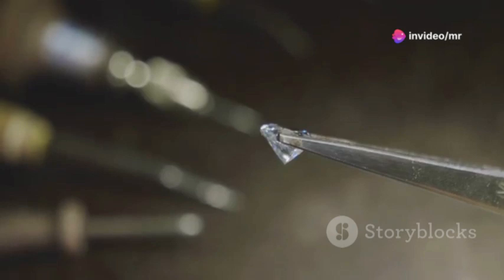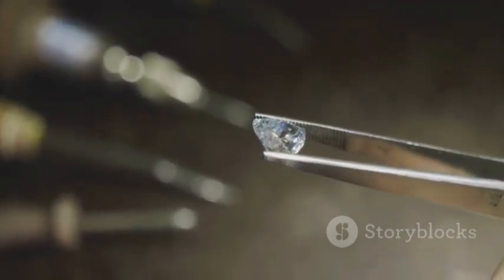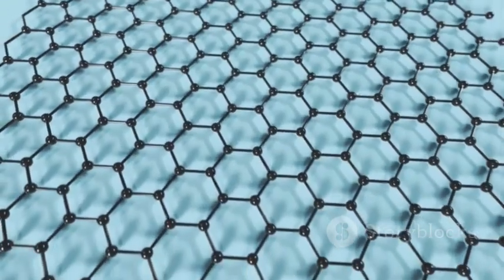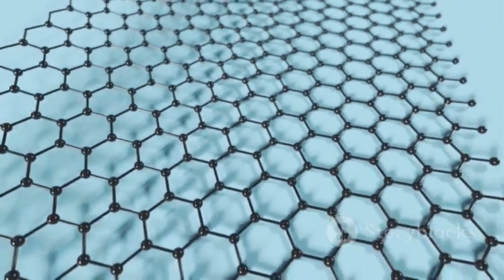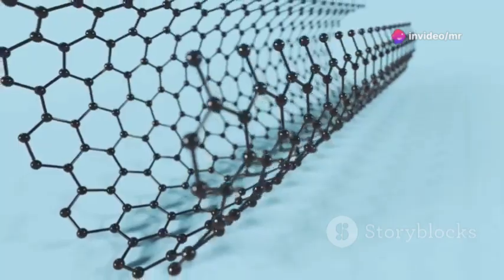X-ray diffraction, or XRD, helps us identify these fingerprints and tell different materials apart. By analyzing how X-rays scatter off a material, we can determine its atomic structure. Think about diamond and graphite. Both are fascinating examples of how the same element can form vastly different materials. Both are made of pure carbon, but they have very different properties. This difference is due to the distinct ways their atoms are arranged.